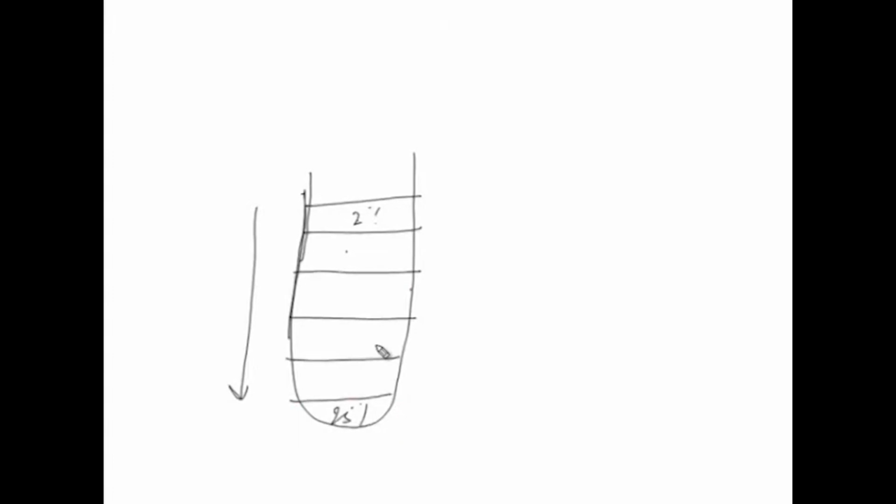the next one, and the lightest one at the top, or it could be made by a gradient maker, as we have discussed in earlier sections. You can use a gradient maker to make a continuous gradient, where the lowest part at the bottom of the tube contains the highest gradient material, and the upper part or the start of the tube has a lighter, or you can say lower, concentration. The sample of a particular material or particular components, which could be macromolecules or subcellular organelles, is placed in here, and then centrifugation is performed.